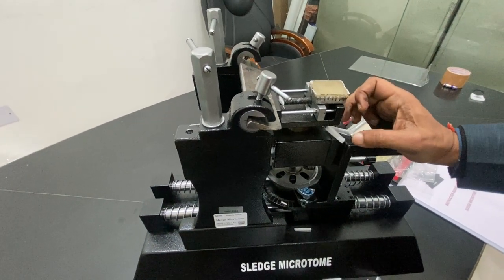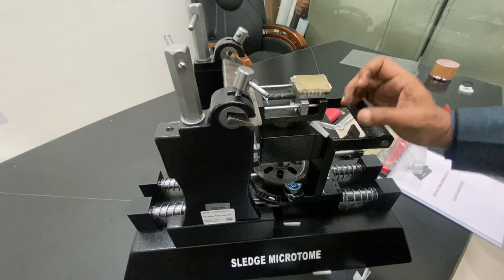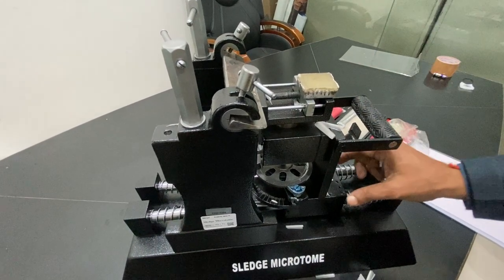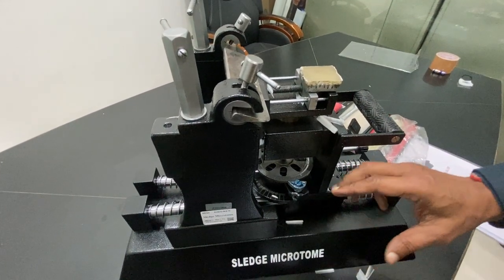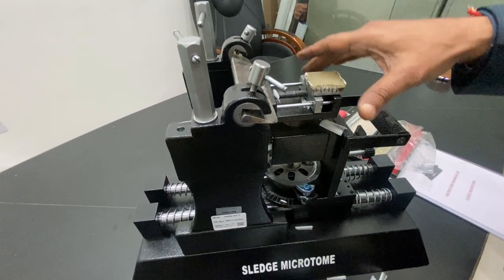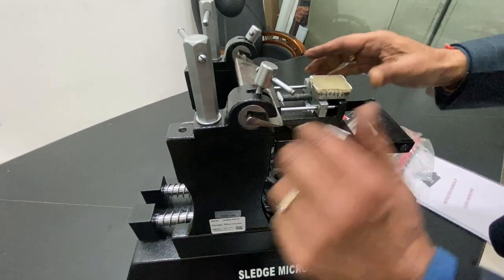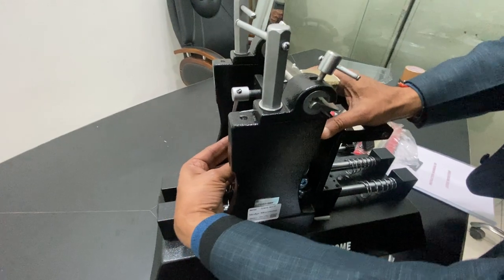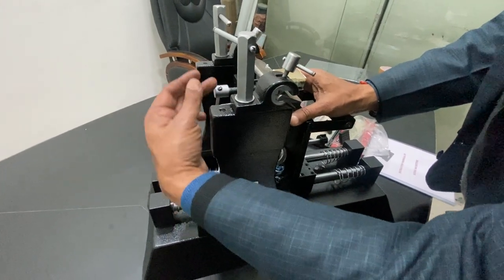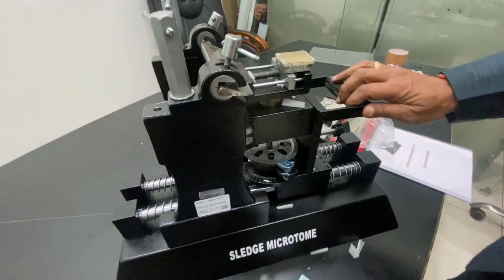Your bone or tissue sample will be coming, and then you have to put these on the slide and heat it on the hot plate or water bath, and then take a sample from the water bath and use it. This can be brought back after the block has come to the top, and you can put in a new block. Lowering is very easy, just push these two levers and it brings down. Adjust these. So once again, I'll give you one demonstration.